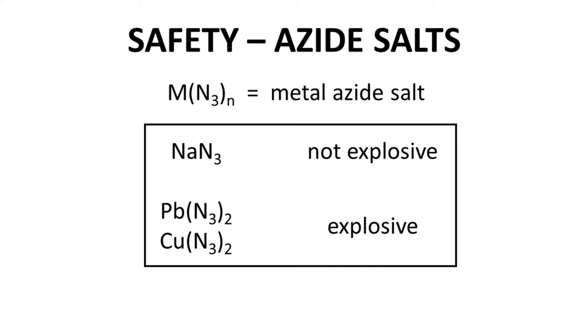While sodium azide is relatively safe under most laboratory conditions, other salts like lead azide and copper azide are both very explosive and very unstable. Lead and copper azide are sometimes formed when sodium azide solutions are not disposed properly. If sodium azide waste is regularly dumped down a drain that contains copper or lead pipes, lead or copper azide can build up over time and eventually lead to an explosion.